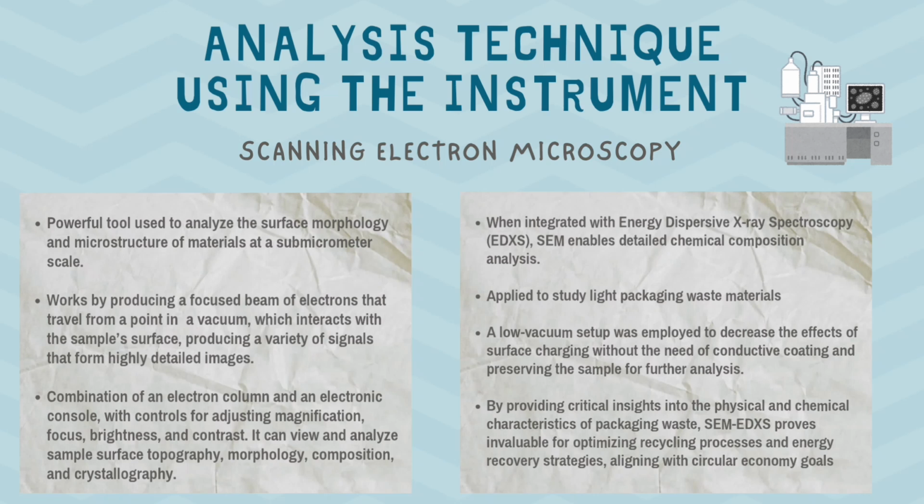This combined technique was applied to study light packaging waste materials, including polypropylene and polyethylene terephthalate. A low vacuum setup was employed to decrease the effects of surface charging without the need for conductive coating, preserving the sample for further analysis. By providing critical insights into the physical and chemical characteristics of packaging waste, SEM-EDXS proved invaluable for optimizing recycling processes and energy recovery strategies, aligning with circular economy goals.